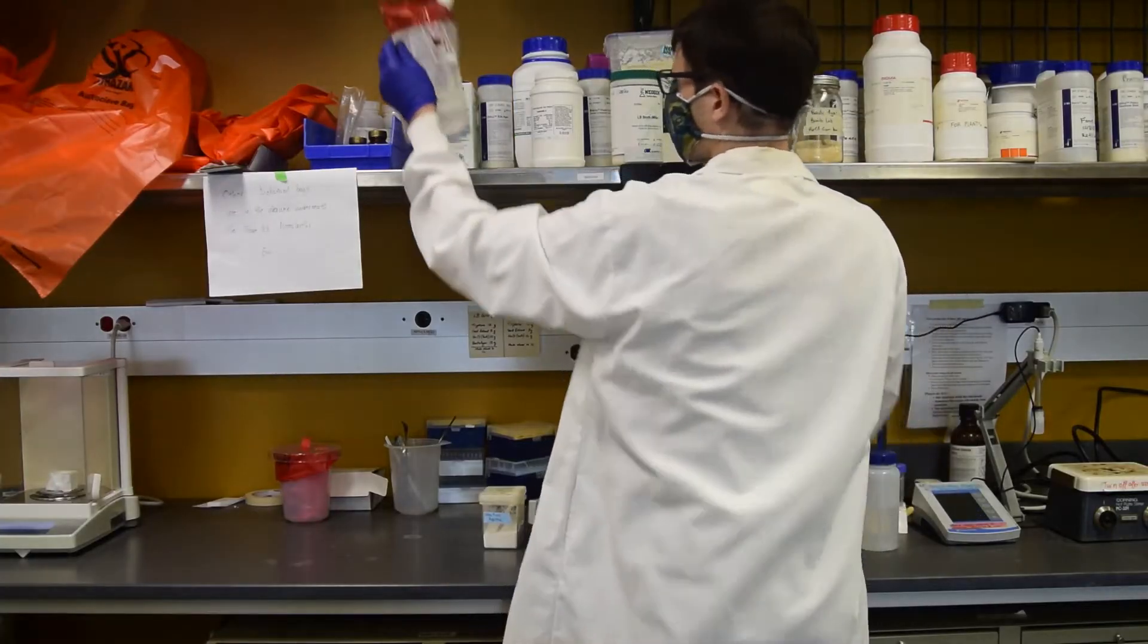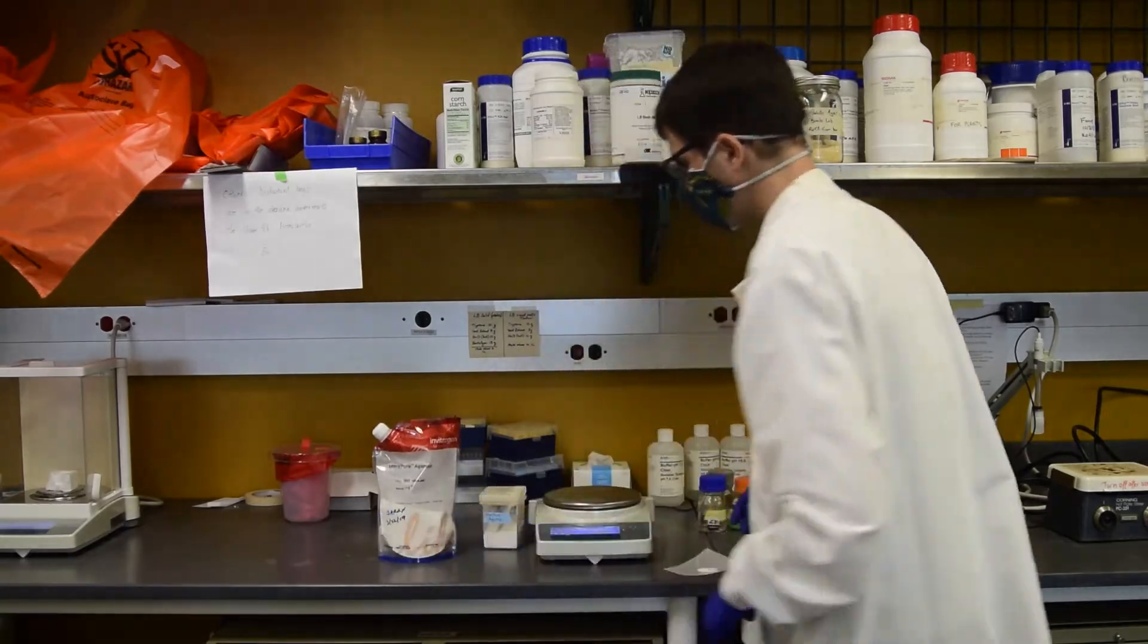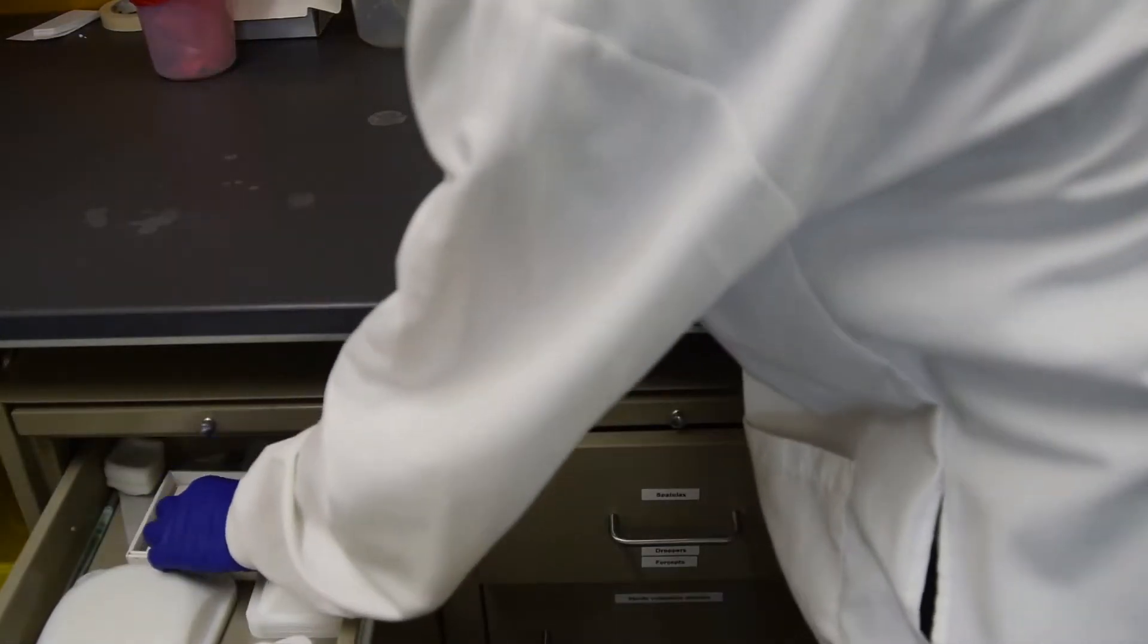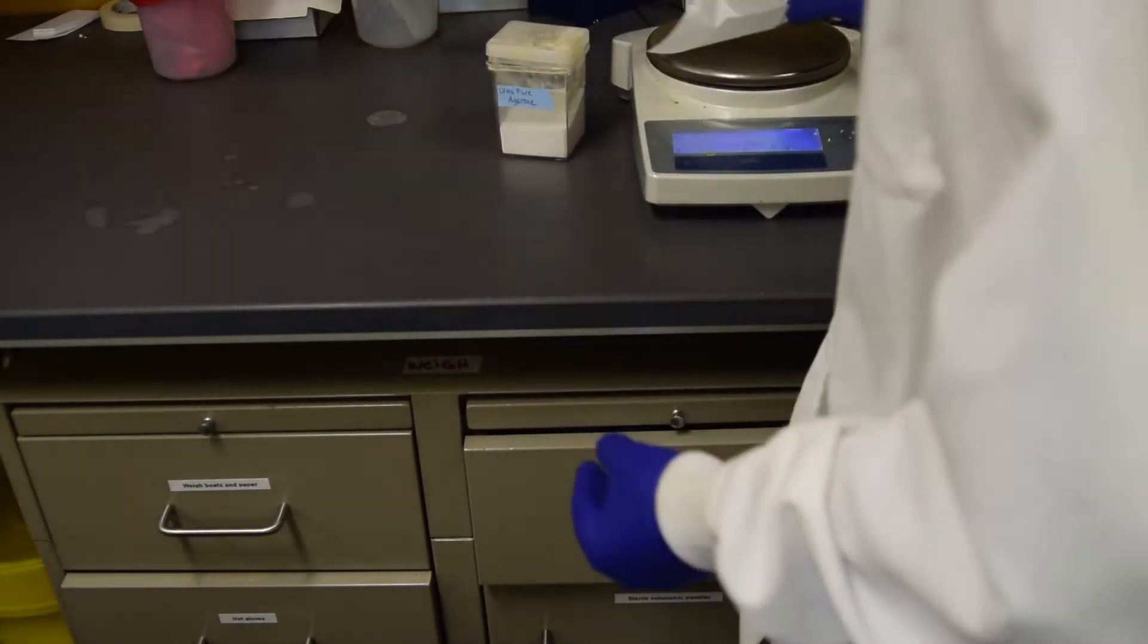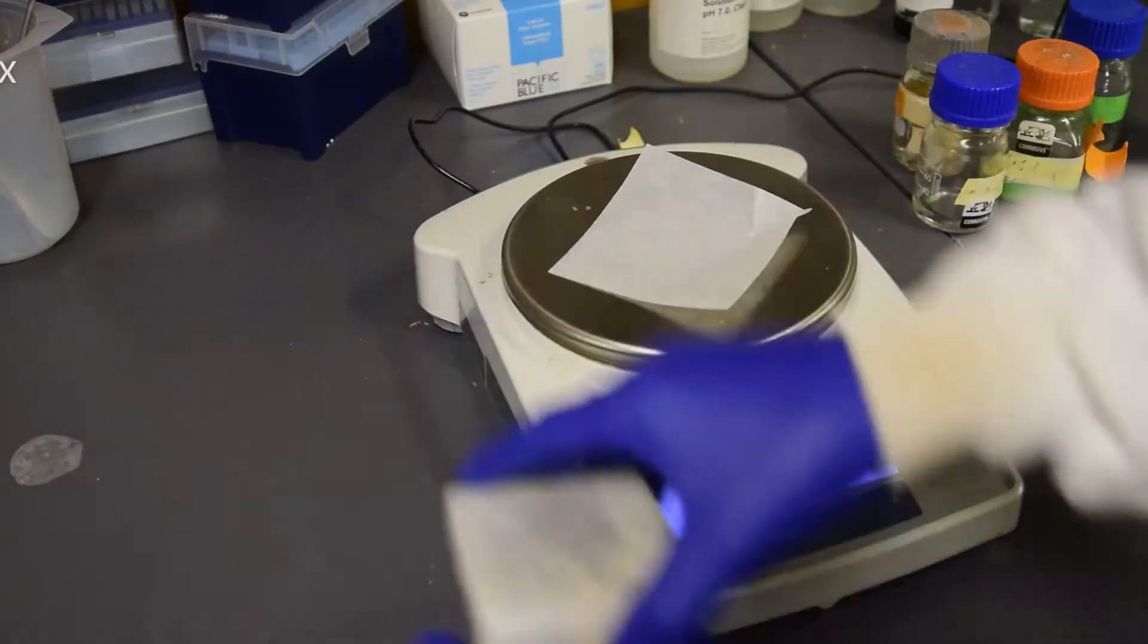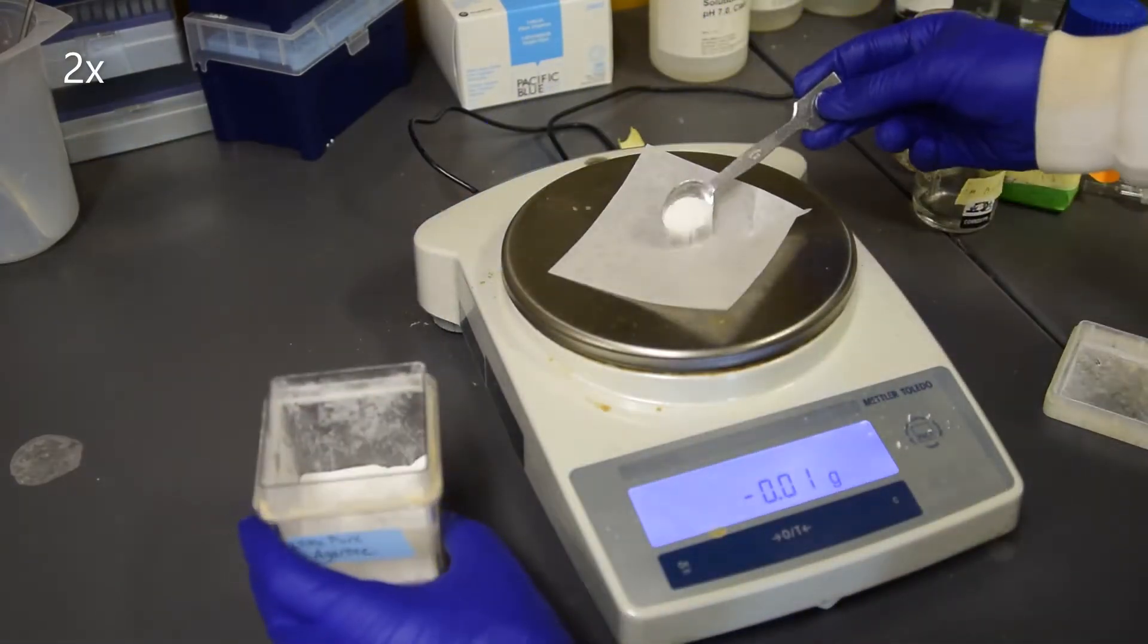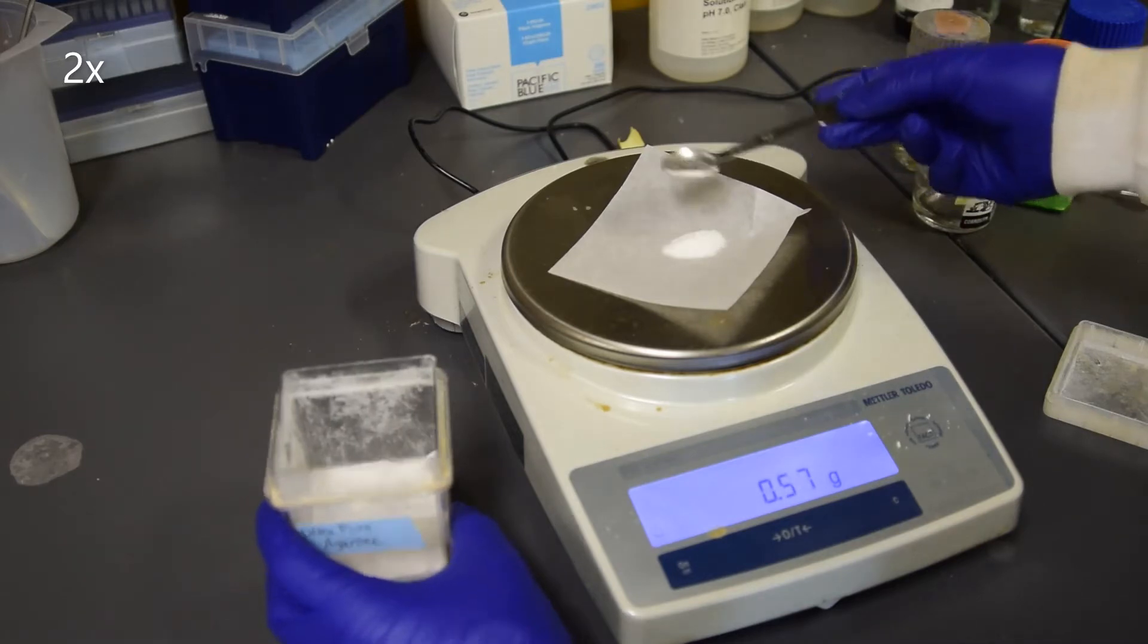We need to measure out agarose to make the gel. Extra agarose can be found in a pouch on the shelf above the balances. Wear a lab coat and gloves in the gel room. I use weighing paper because it's usually an amount less than 1 gram. Weigh out enough agarose for 0.9% of the gel's volume, so here we have 0.45 grams for a 50ml gel.